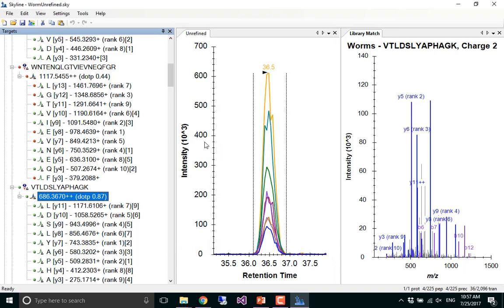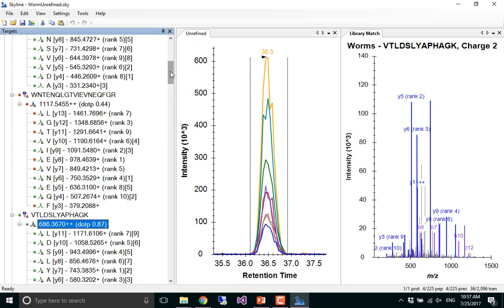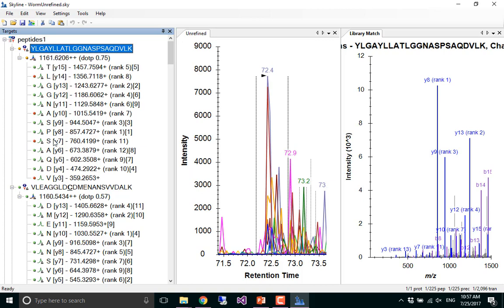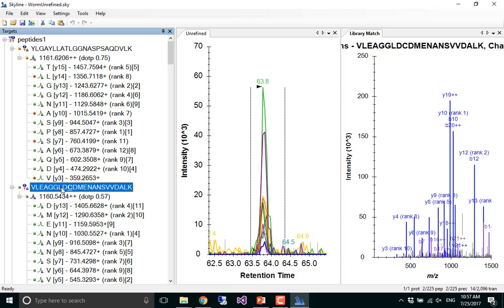All right, so this is a really nice example of a peptide. The design of this experiment is just to measure everything, and then decide what is measurable and what we should take to the next level. These are all worm peptides, and I think we just got a bunch of worm peptides that were in our library. In this case, there are 225 of them. We're so cheap that we never want to buy standards, so how far can we get with actually measuring things?